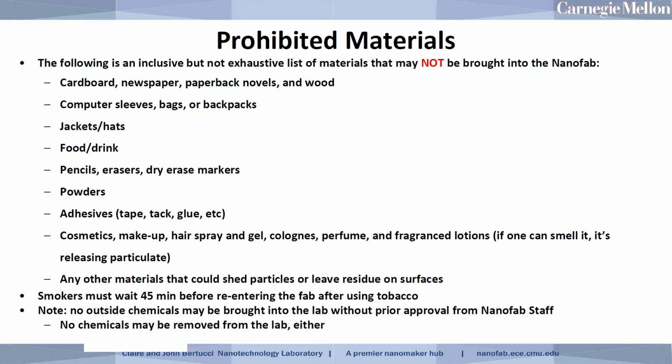And anytime that we have a need for adhesives in the lab, we have a clean room compatible version that we either stock in the storeroom for sale or just make available to users. So we have things like Kapton tape, which can be used in certain vacuum systems. We have just kind of standard tape to use outside of vacuum systems that doesn't leave a sticky residue. We have certain vacuum compatible greases and double-sided tapes that we use for mounting samples. So anything like that we're going to have inside the clean room.